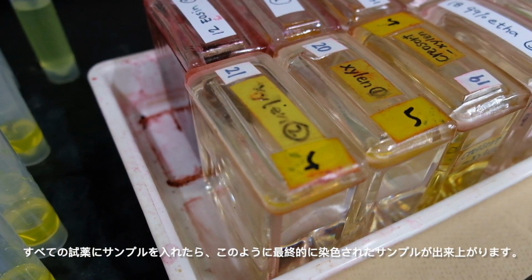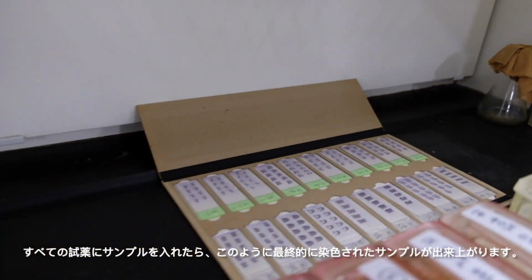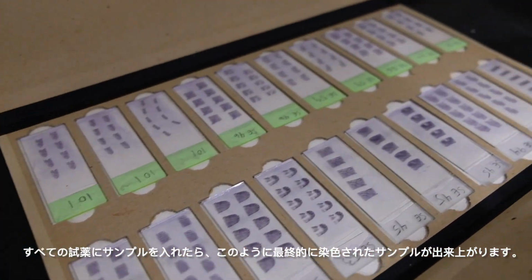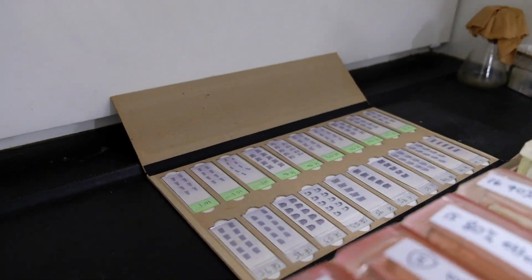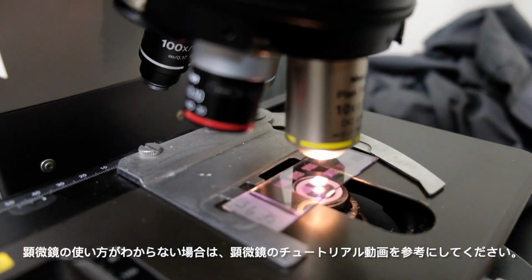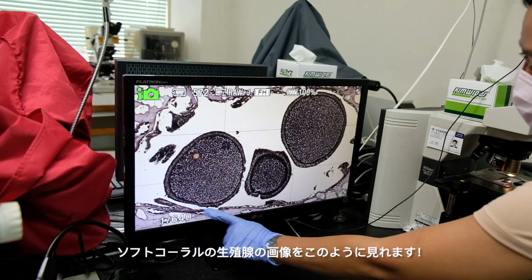So now, once you've gone through all of the reagents and maybe used the mounting reagent, you will have stained slides that look like this. And we can put it under the microscope to see what the final results of the tissues look like. If you don't know how to use a microscope, please refer to the microscope video, but here are the final products of some of the tissues.